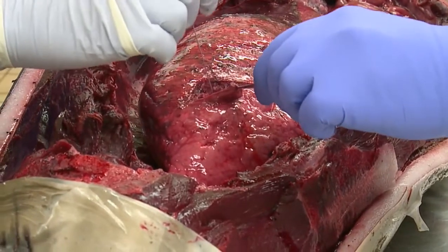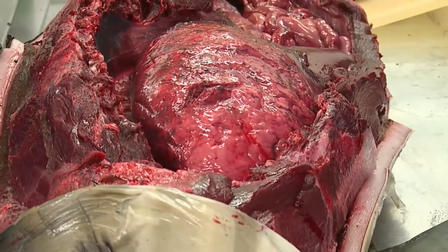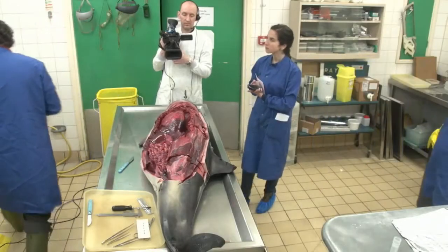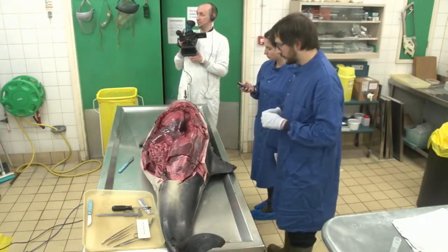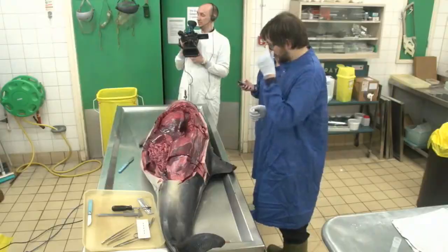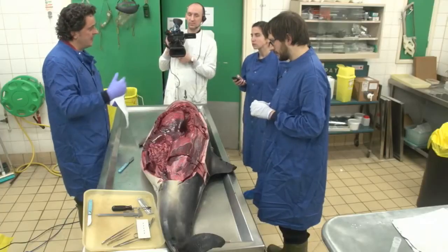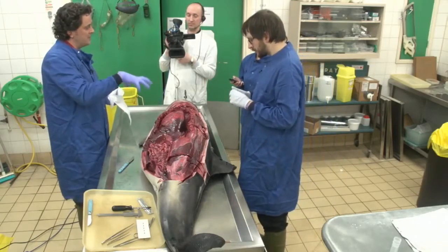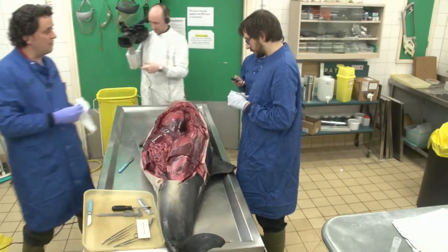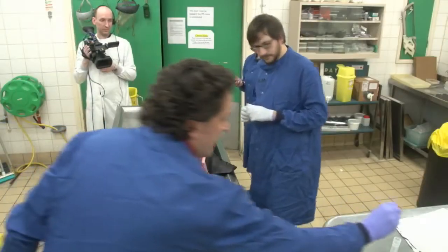The other thing to note about this animal is it was very, very fresh when it came in to Strand, and it's still bleeding. That would tend to suggest whatever had happened to it had happened fairly close to shore. That's a little bit different compared to our normal bycatch cases. Most common dolphin bycatch cases that we've seen in terms of Strand animals tend to be relatively decomposed because they died out at sea and then wash up. So that would suggest this animal was probably caught fairly close inshore. I'm going to come back to that in a bit.